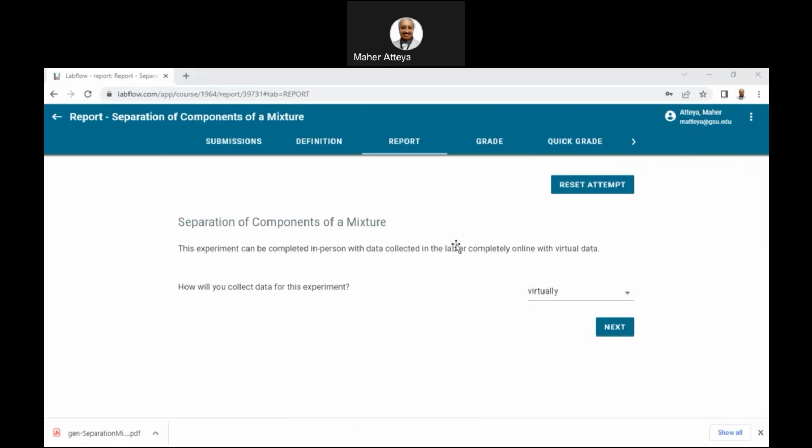And click next on the tab. Yes, and click next. So let me just highlight this one, right? We are clicking next, and next is here.